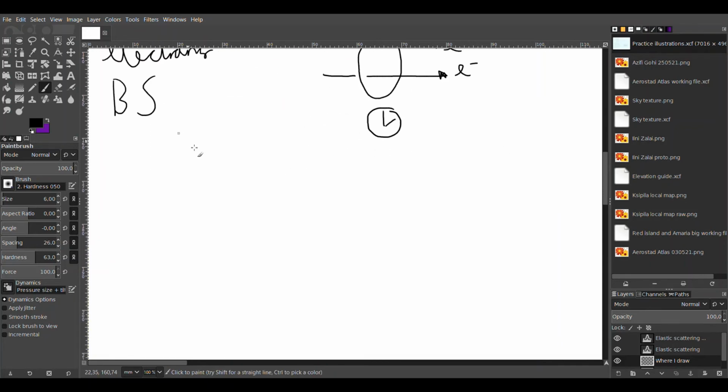One thing that is interesting is that backscattering happens with interaction with atoms. So this is an atom. Yes, I model it as a ball. You can argue how correct that is, but let's just say it's okay to model an atom as a ball. One does it all the time in material science, so let's just assume it's okay. Any chemists out there might disagree. It might actually be the core of the atom, but I just say atom for now.